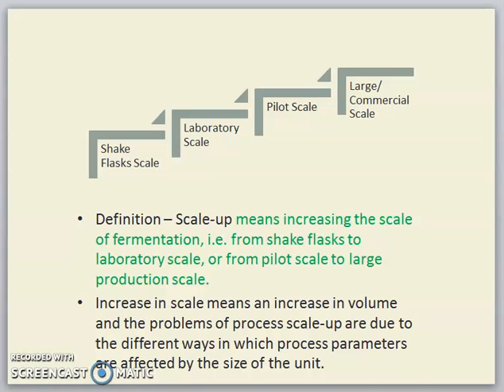Now, these are the stages involved in scale-up processes, particularly if we plan to produce a new product that we are unsure of. How would the cell behave? We have to start from the shake flask. In the fermentation or bioreaction, we need to start with the shake flask, and this shake flask study is usually done in the lab scale. So when we have this shake flask, then we know that we are in the lab scale stage.